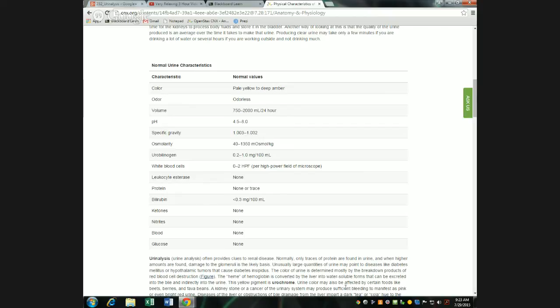The centrifuge has 8 spots for spinning tubes of this size, and there are definitely more than 8 tubes, so I'll have to do a couple of spins. I'll hold this up in front of you, and I'll point at whichever of the 2 positions in the carrier you go in. There's a number right here on the front, so I'll say you're number 1 or you're number 2. I will try to remember to say number 1 of the first spin, number 1 of the second spin, that kind of thing. But pay attention.